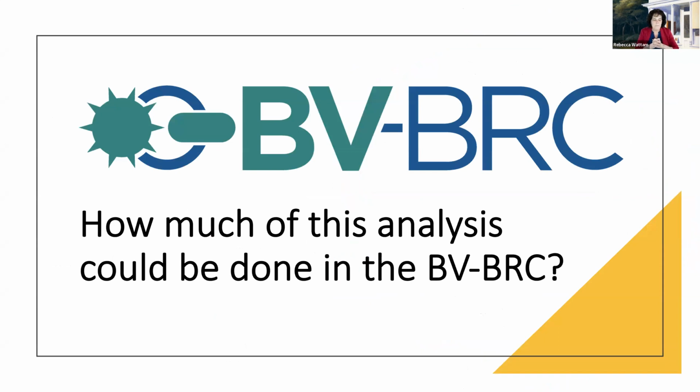So if you've taken my other webinar in this series, and I'll be doing 2 more too, in each of these I explore what I could replicate in BVBRC. These researchers went to a lot of different sources. They used a lot of different software to try to do this analysis. And remember, every time you're changing from one software pipeline to another, there's often some massaging of the data that you need to do. So think about that when you're doing your analysis.